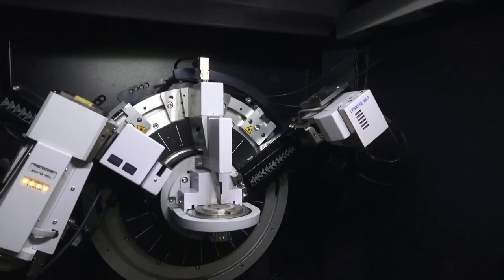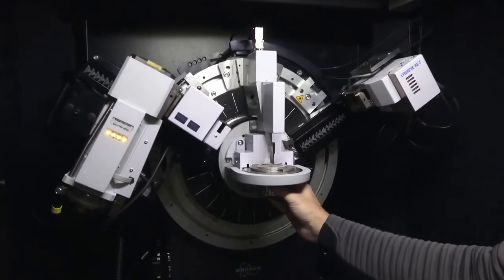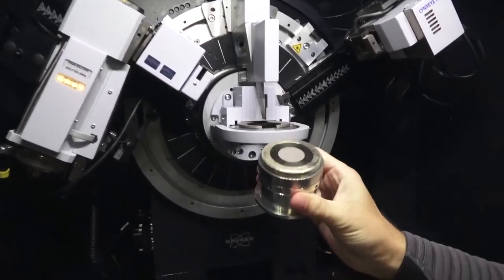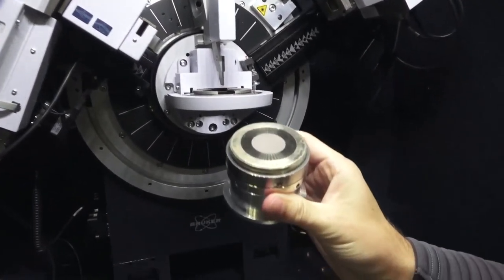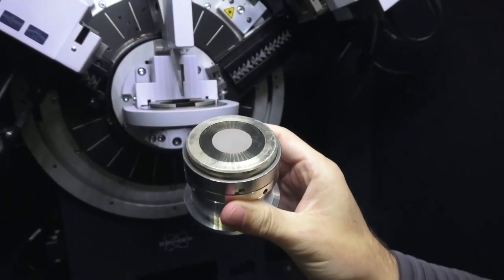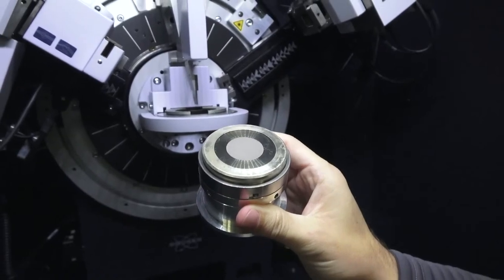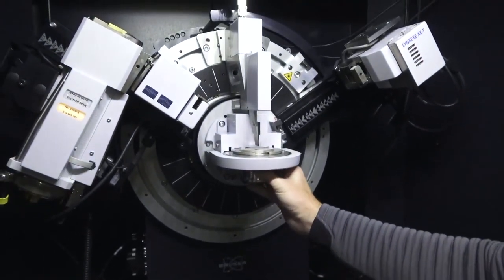And where's the sample at? So the sample is right here in the middle. Okay. You can see I can unload it. So we'd call that a powder because it's actually a powder that you packed in? Yep, this is a loose powder that we packed into the sample holder, into the sample cavity, and smoothed it over. Now, is that a typical nickel filter in front of your detector?